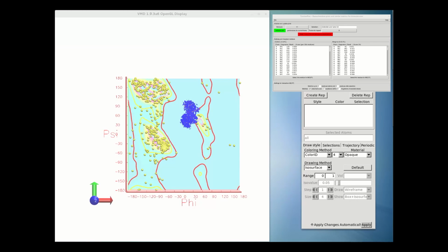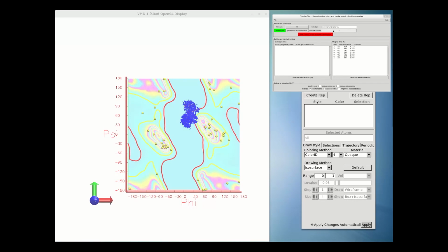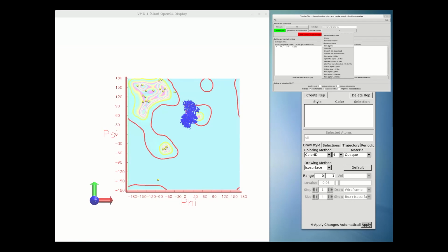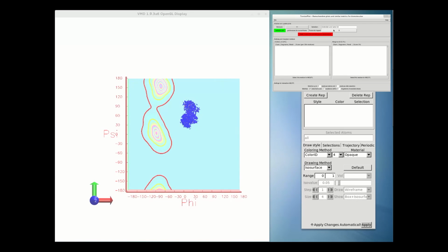While we're waiting for that, I'll give you a few more details of the simulation. It's running under implicit solvent conditions in the CUDA build of NAMD 2.11 Beta 2 on a 5-year-old Xeon workstation aided by a GTX Titan GPU kindly donated by NVIDIA. The Ramachandran plot is being updated every 5 time steps. As well as this machine, I also run this on a 2014 model gaming laptop equipped with a GTX 980M GPU with excellent performance.